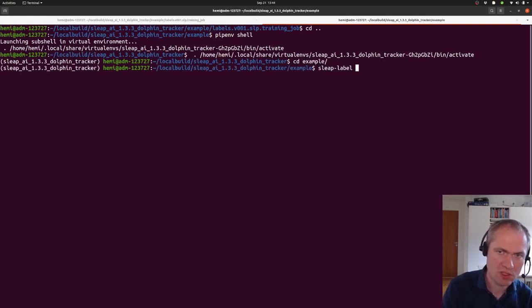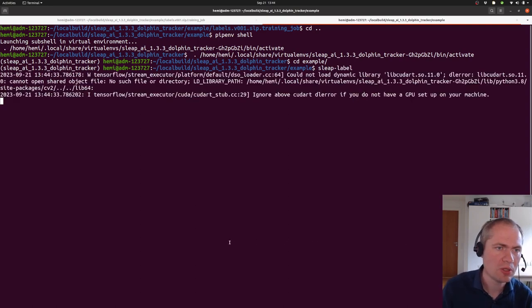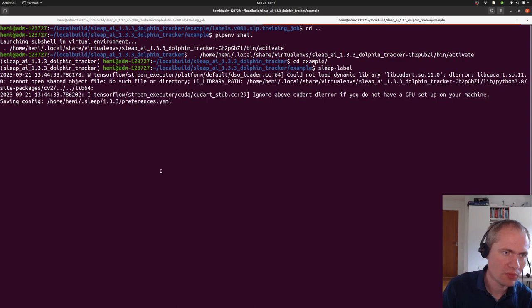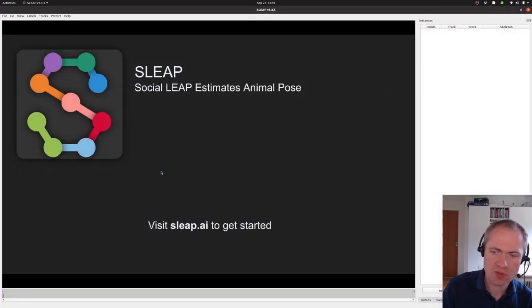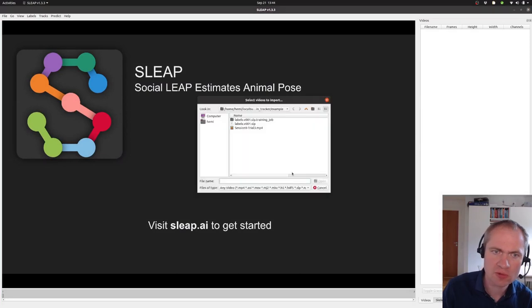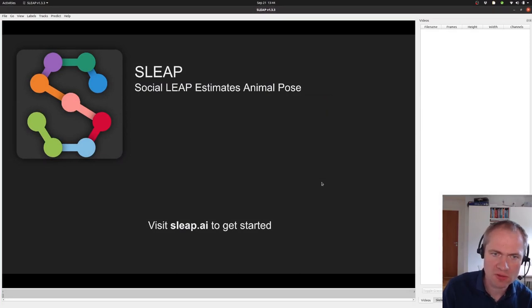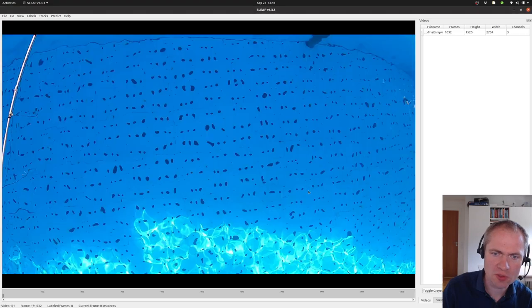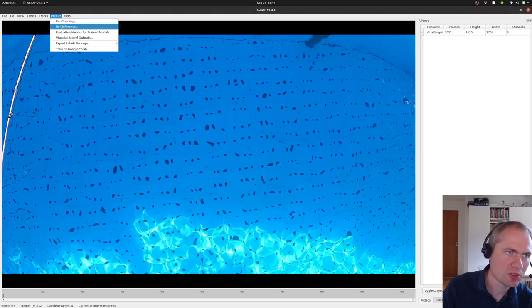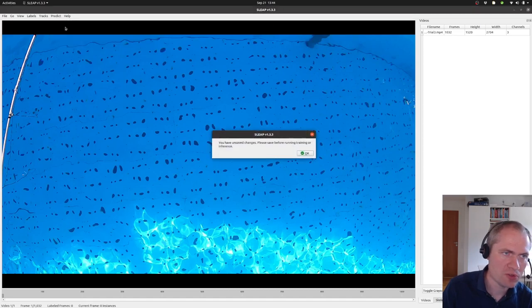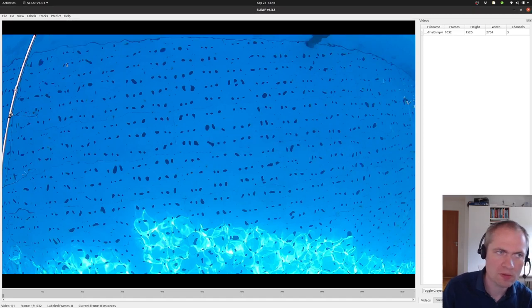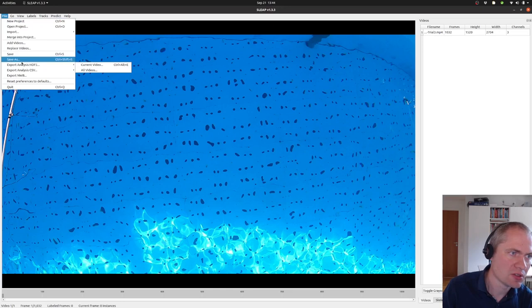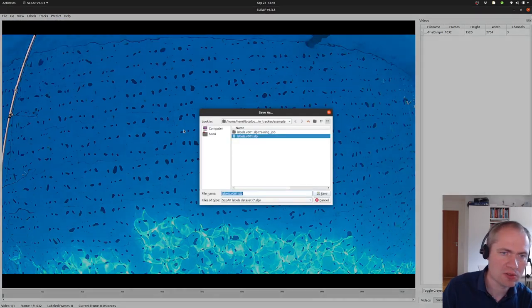So SLEAP label as we had before. For this to work, we need to load a new video. We had the same example as before, we just imported. And then we can run the prediction step here or run inference.